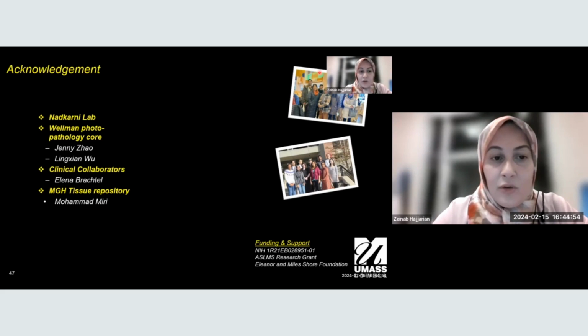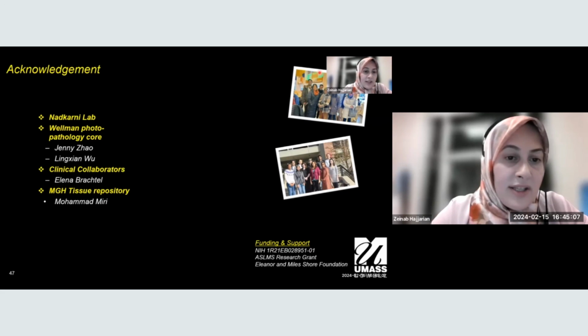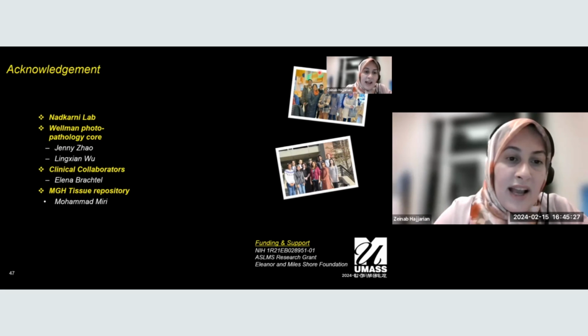Our samples were fresh excised tissue, a couple of millimeters thick. Our technique right now is not depth resolved. We submitted the sections for histopathological analysis, where they obtain sections every 100 micron. What we saw was that our measurements were correlated with the histology. It's a depth integrated technique, and we were correlated up to 500 micron thickness. So I think that answers this aspect of your question.